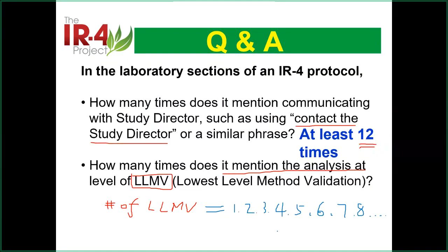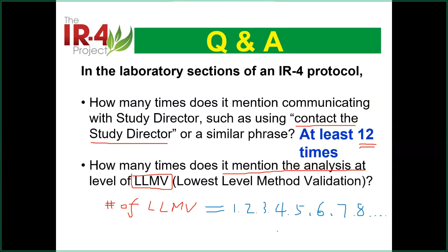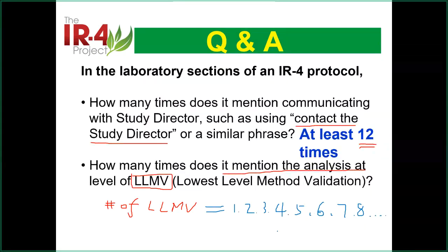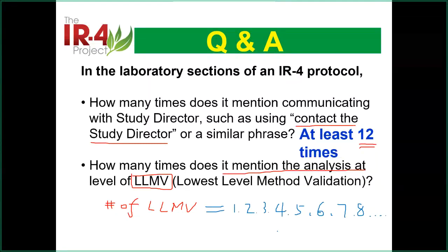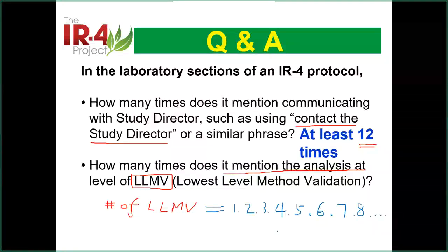And sometimes we say, oh, this is maintenance. And our SOP needs to tell what type of maintenance this is. Is this something we do annually? For example, if you use the LC-MS, you inject it 10,000 times a year. Do you need to change something? Same thing as GC-MS. How often do you have to change the septum, change the column, or do the column refresh, make sure the system is clean?